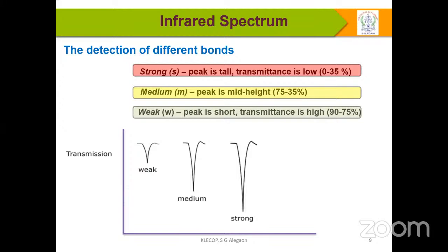Apart from this, we have one more very important peak, the broad peak. It is usually like a Gaussian peak, and it plays an important role for alcohol, carboxylic acid, and carboxylic acid derivatives. Most importantly, it helps to understand whether my compound contains moisture or is completely dry. So the broad peak can help you understand the nature and the condition of my compound.